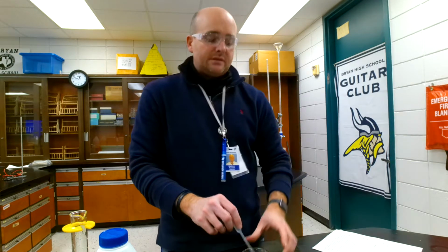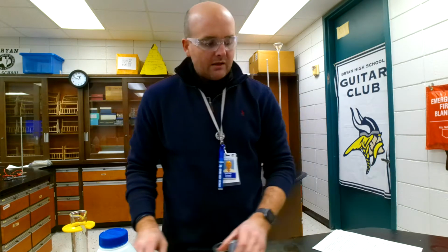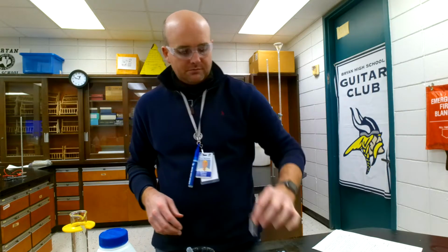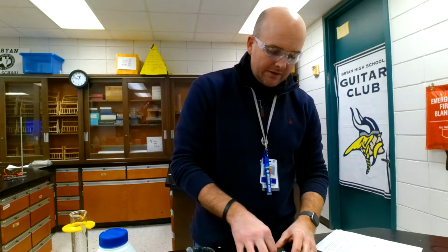So now, to do this, the color is going to change. So we'll use a colorimeter, like I've shown you before. And remember, I've done all the important steps of letting it warm up, and I have also taken a clean cuvette full of deionized water. I place it in there, and I'm setting it to 635 nanometers of absorbance. Then I will calibrate it, make sure that's okay, and then I'm going to let it go.